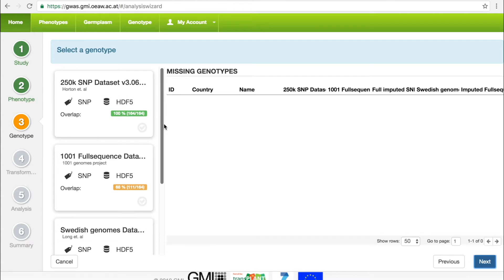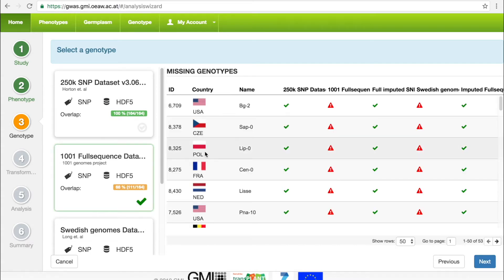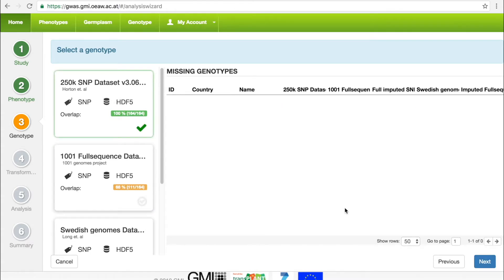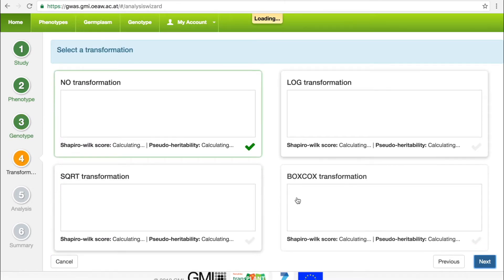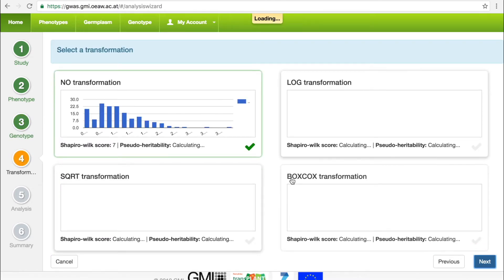If the user chooses a genotype with less than 100% overlap, the missing accessions are displayed and will be discarded in later steps. Here we choose the 250k due to its 100% overlap.